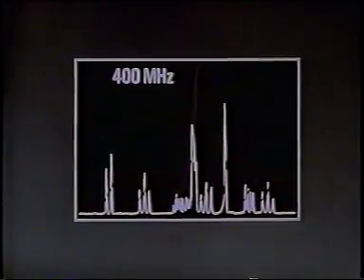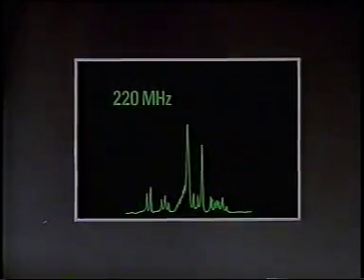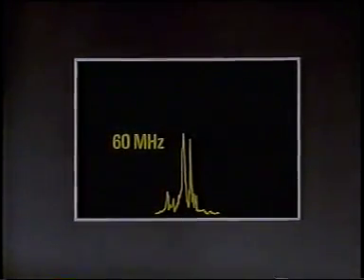This sequence shows NMR spectra of the same sugar recorded with different types of instrument. Can you see what's happening? As the magnetic field strength decreases, and hence the applied frequency decreases, the patterns are becoming less discrete. In this spectrum, the patterns are complex and distorted. It's called a second-order spectrum.